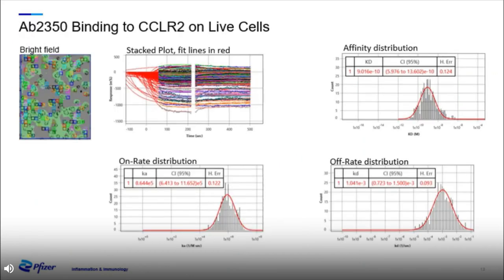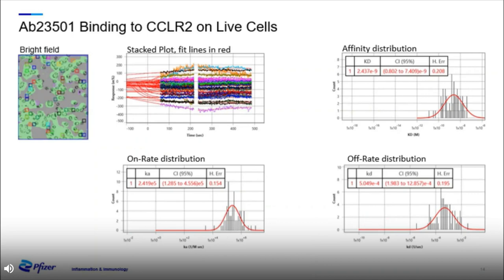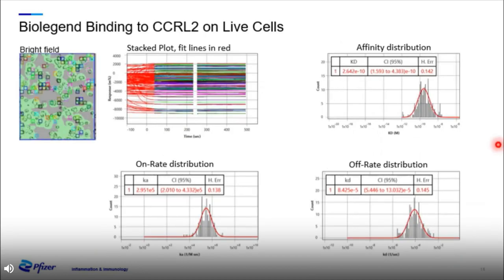Now back to a binder: antibody 2350 from R&D Systems binding to CCRL2 expressed on live cells. You can see a nice ROI pattern and good fit data, with a good affinity distribution as well as on-rate and off-rate data. Antibody 23501 is not as strong as 2350 in this instance, but still shows measurable binding and decent binding kinetics and affinity. The BioLegend antibody generated quite large response units, making the actual fit lines hard to see, but it shows excellent binding affinity and good rate kinetics.